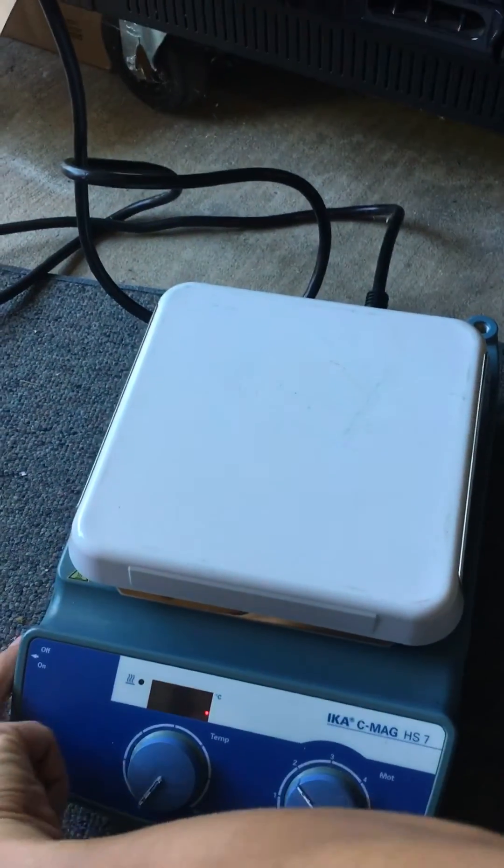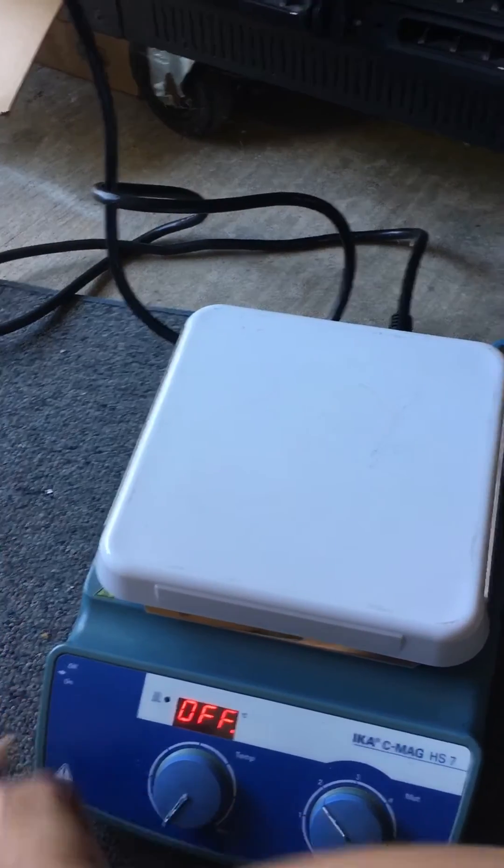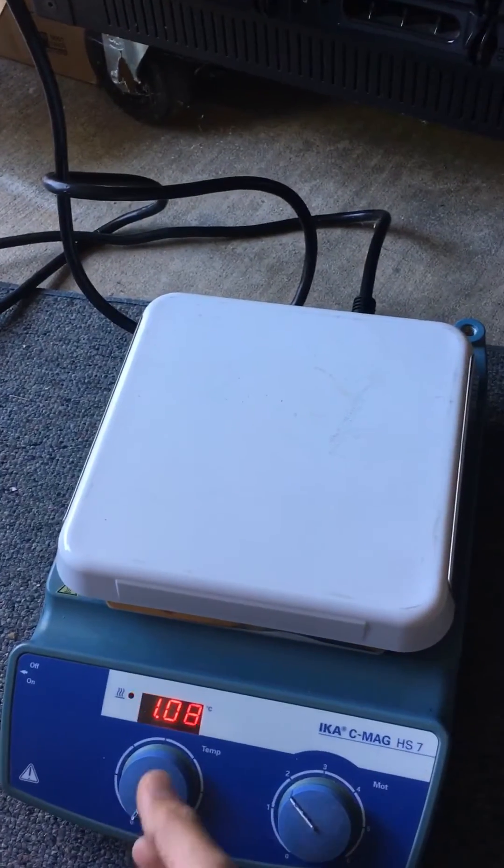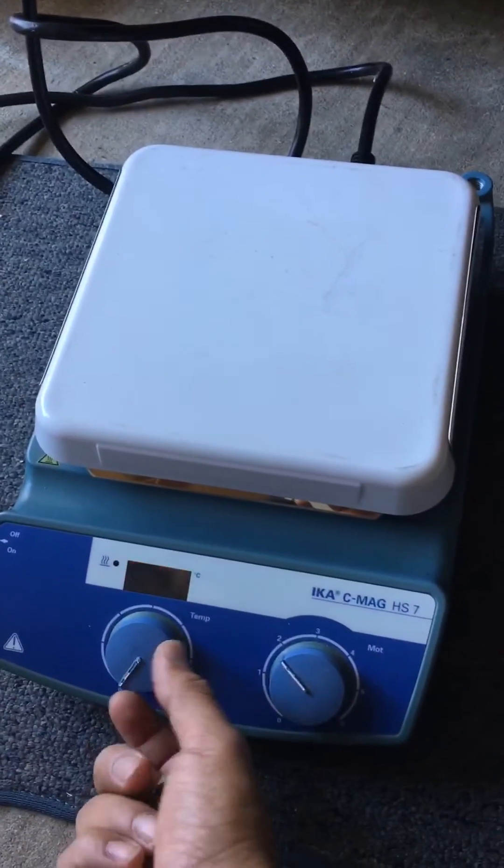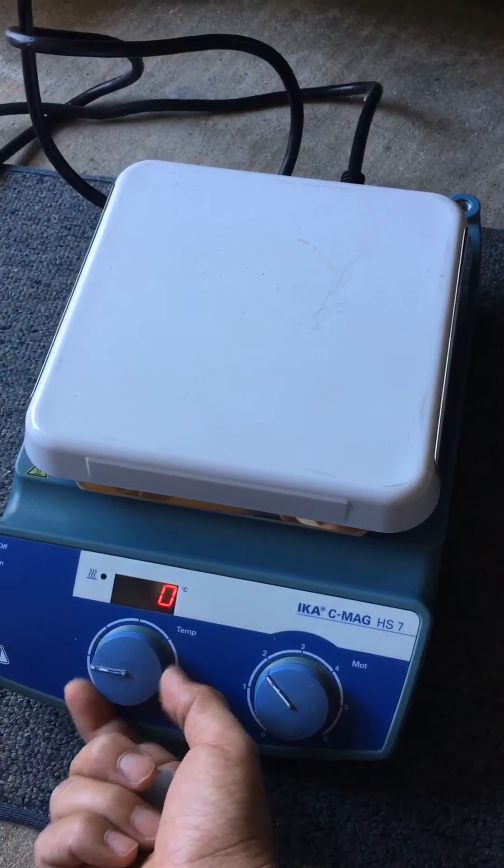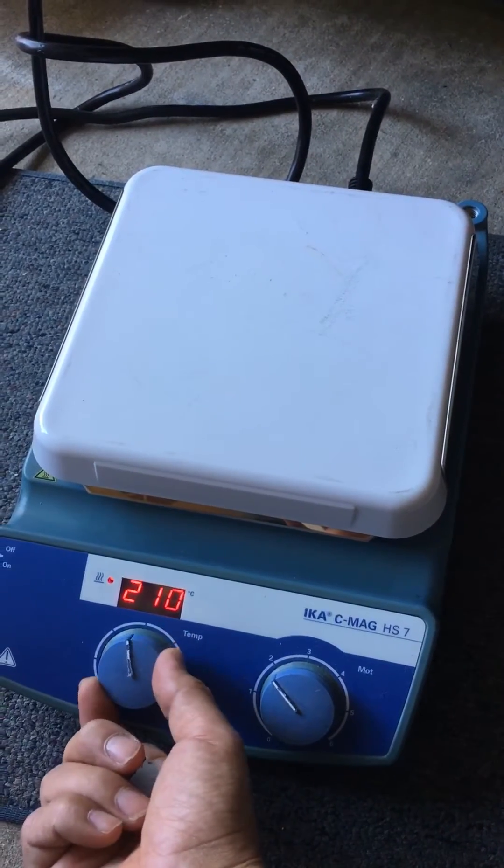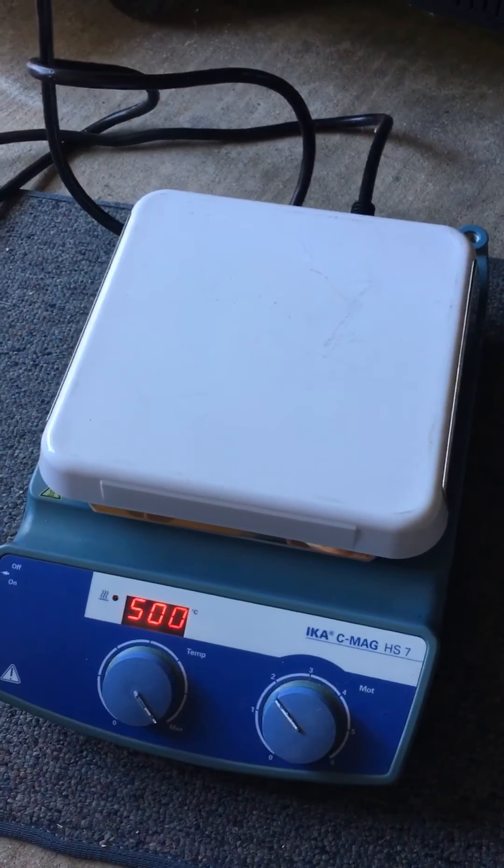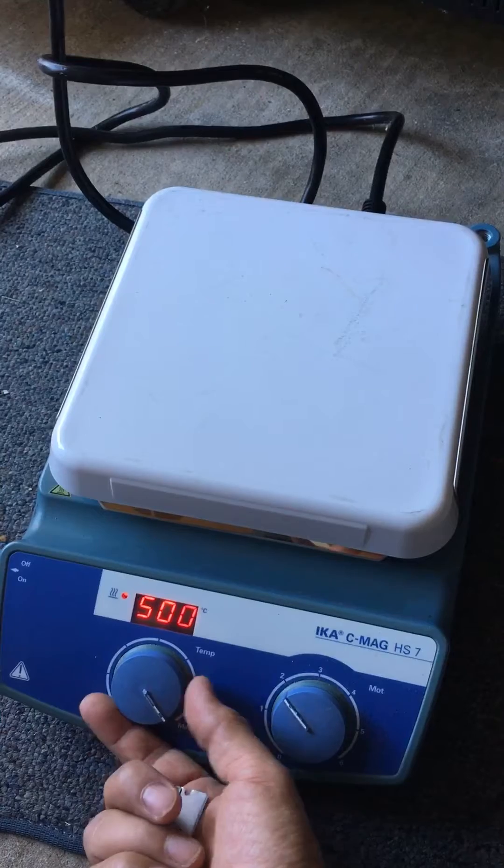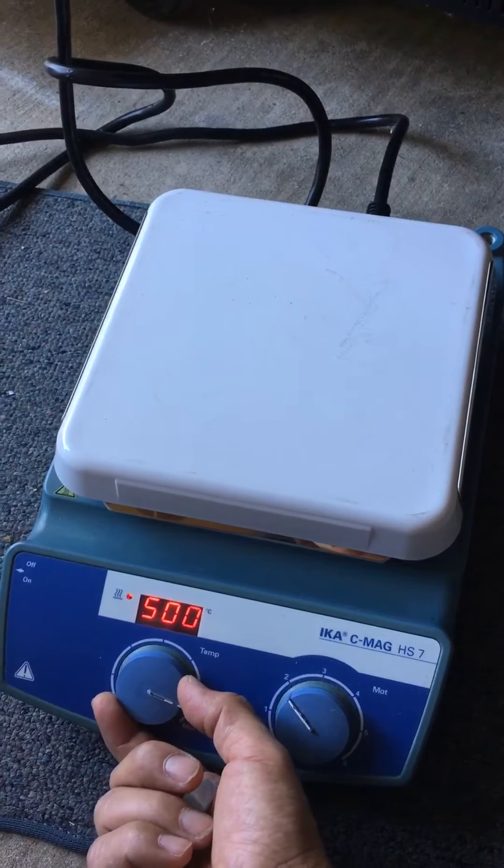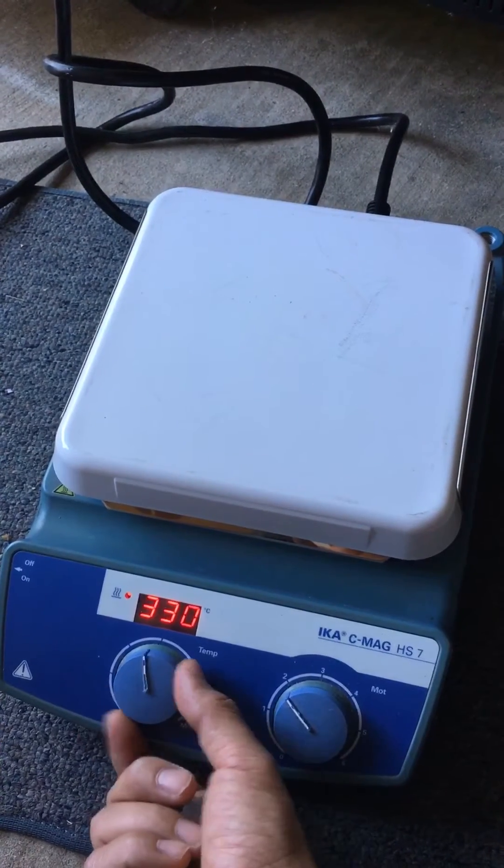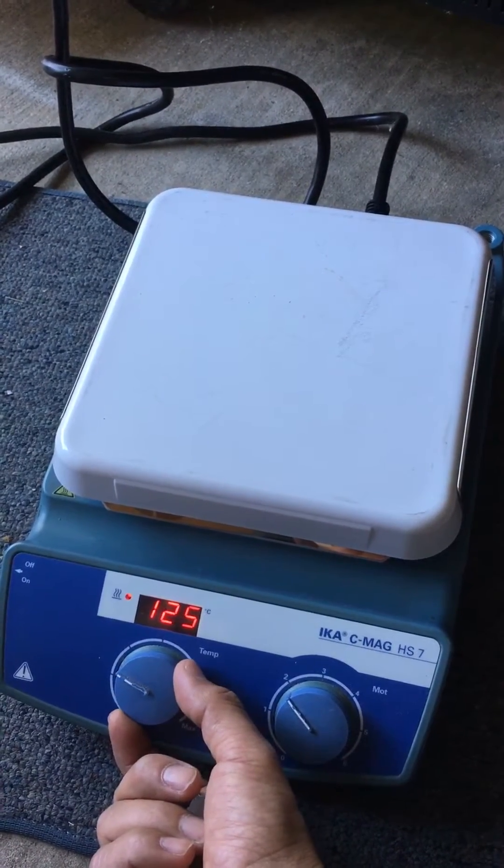Here on the left there's a switch. Turn it on, and if you go up with the temperature, it goes all the way up to 500. And man, this goes up really hot, very fast.